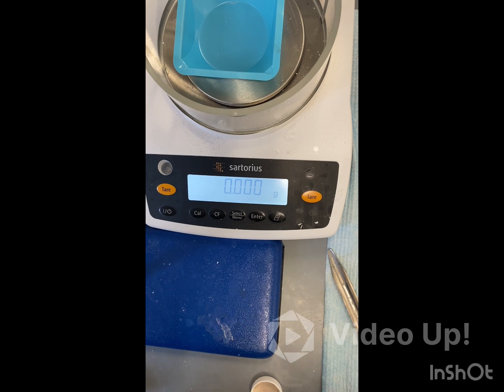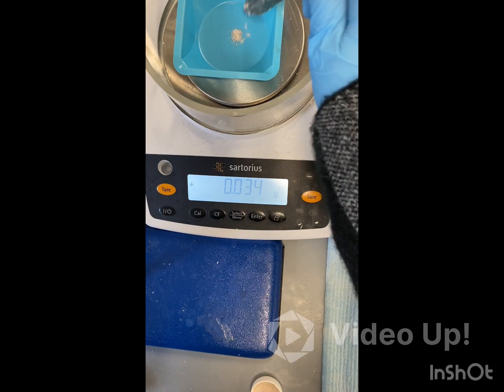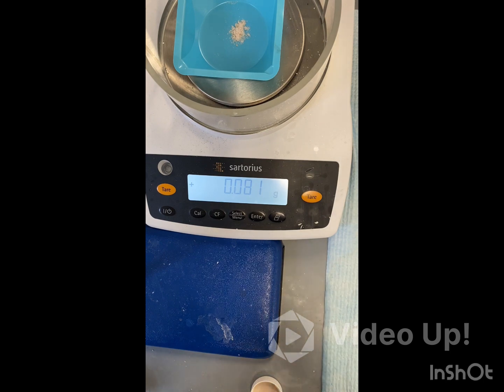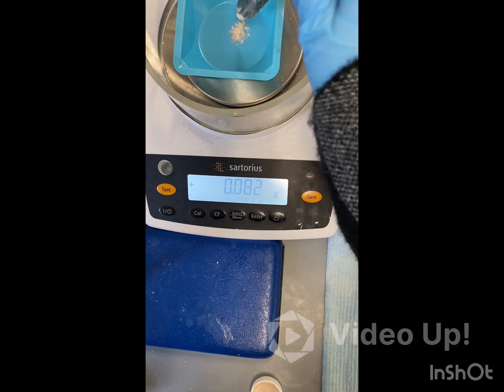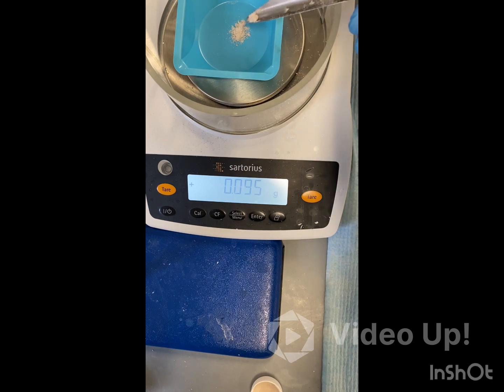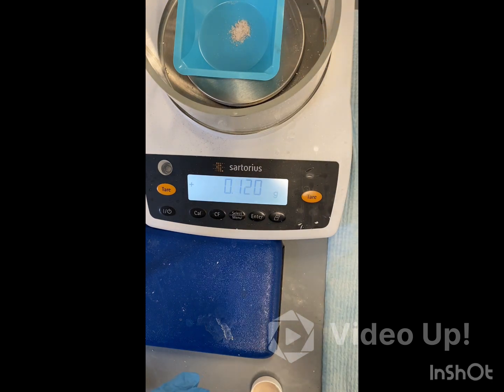Now that we have our safety goggles and gloves on, we're going to get around 100 mg of vanillin acetate. I went ahead and put a weigh boat on the scale and tared it, so we're just going to weigh out around 0.1 g or 100 mg of our vanillin acetate. We're a little over, but that's alright — we just want to record that final mass. Our final mass is 0.120 g.